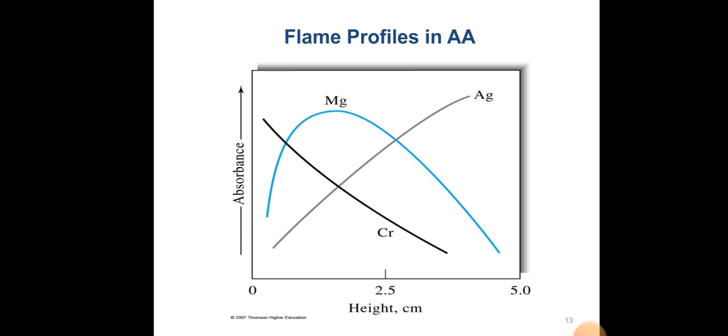But for elements like magnesium and many other elements, there is a medium height that gives you the best absorbance results.